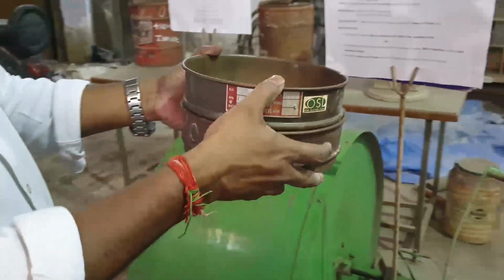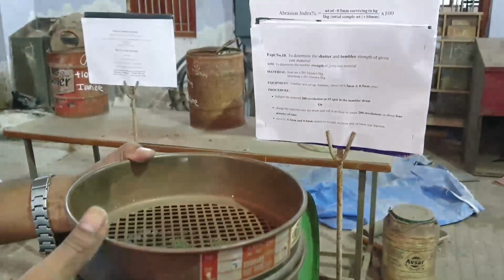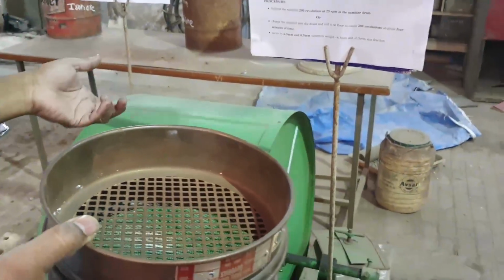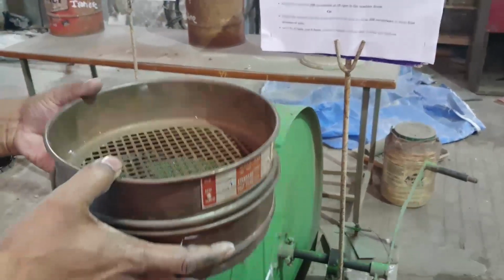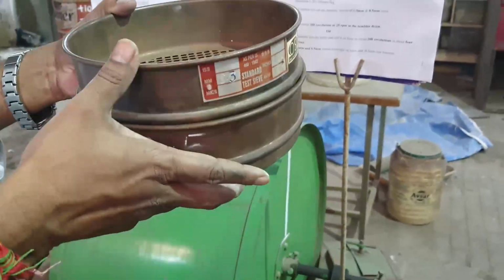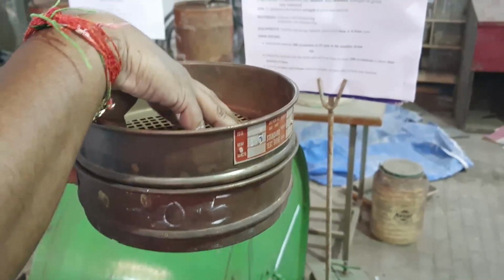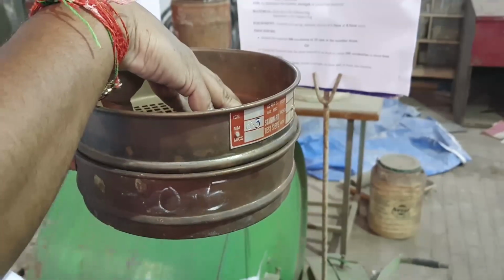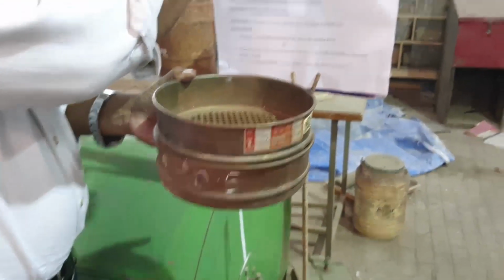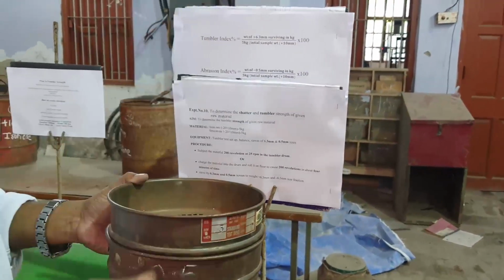That is the 6.3 mm screen, and here this is the 0.5 mm screen. Whatever material was subjected to the tumbler action, we will collect and put on the screen, and see what the material weight fraction retained on the 6.3 mm is. That fraction weight we put in the numerator of the tumbler index formula, and the initial weight we know, that is 5 kg, into 100, you will get the tumbler index.